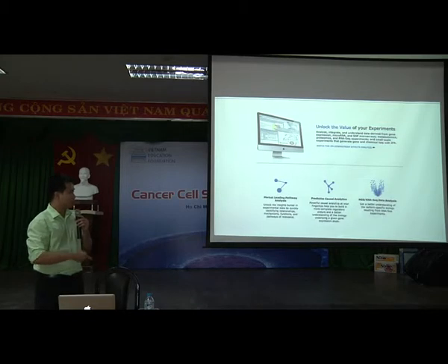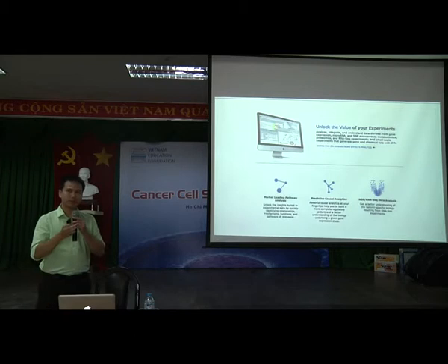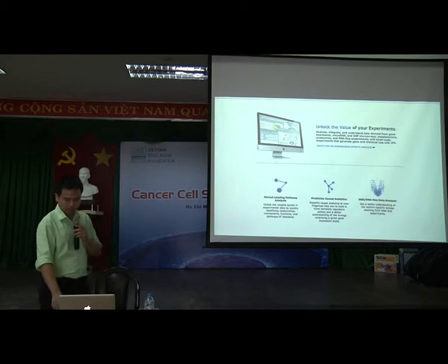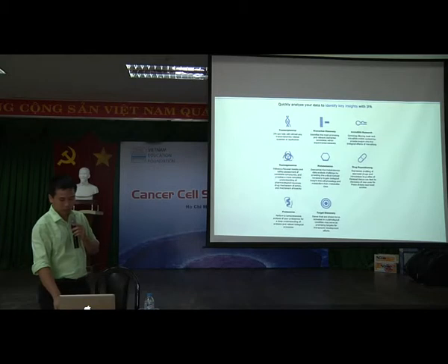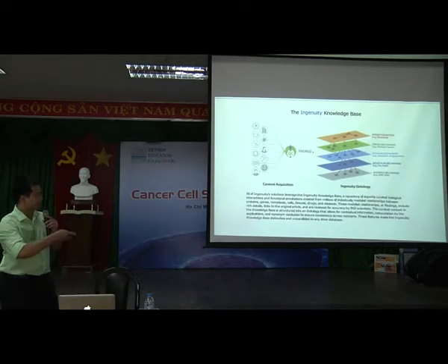We can also use IPA to predict causal analytics, for example, predict what is responsible for the disease or that phenomenon. We can also use IPA to analyze the RNA-seq data as well. So again, IPA can be used for multiple types of analysis like transcriptomics, biomarker discovery, microRNA research, proteomics, etc. And this is what they claim.